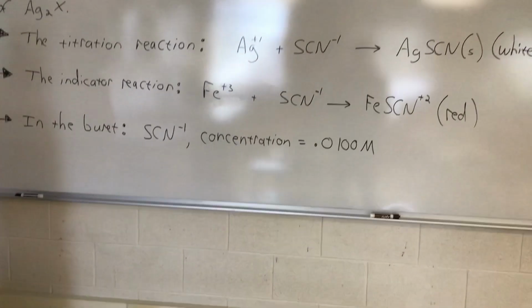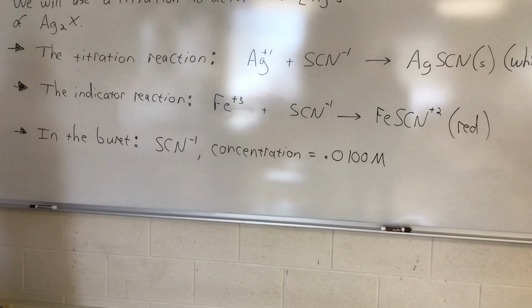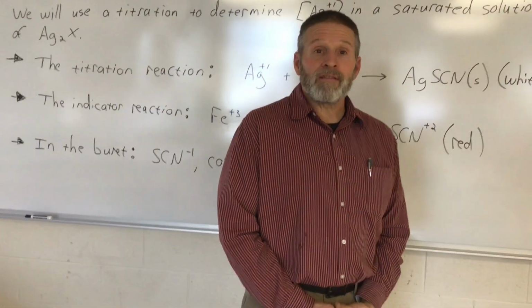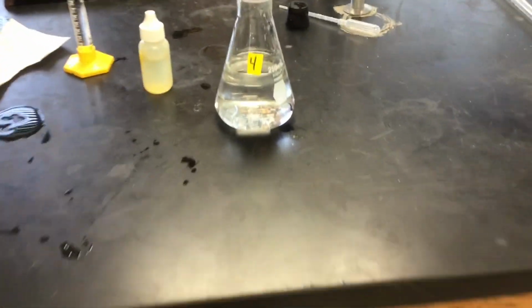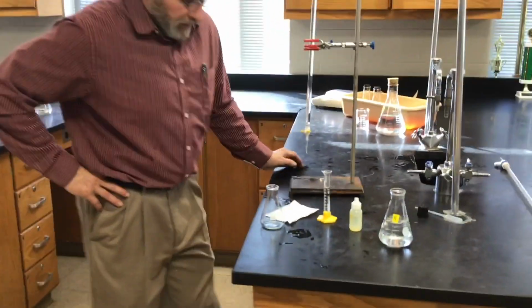Do you have that concentration of thiocyanate? Yep. Let's go run this titration. Last titration of the year, Mr. Hubble. I believe it is. Normally I have Kleenex out because students are crying. Yes, I know. Just say goodbye to the burettes. It's a sad day. Ag2X sample number 4. Here we go.